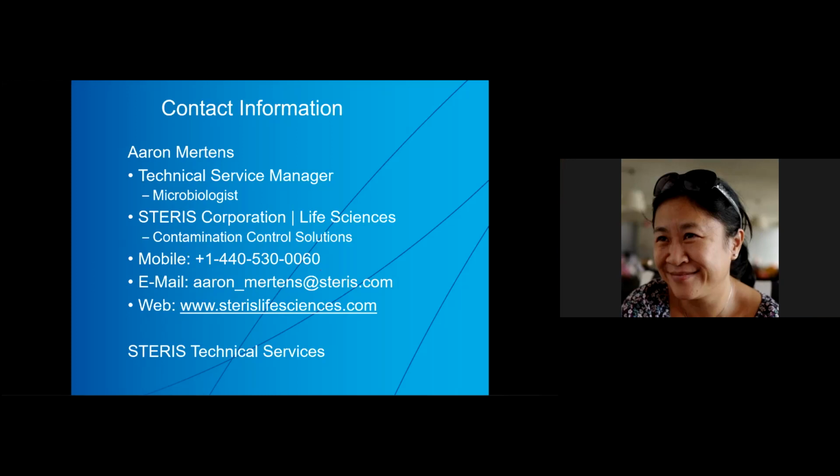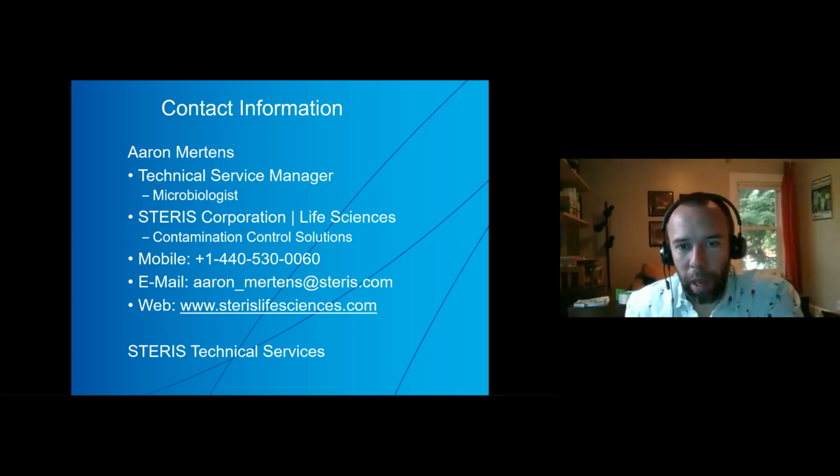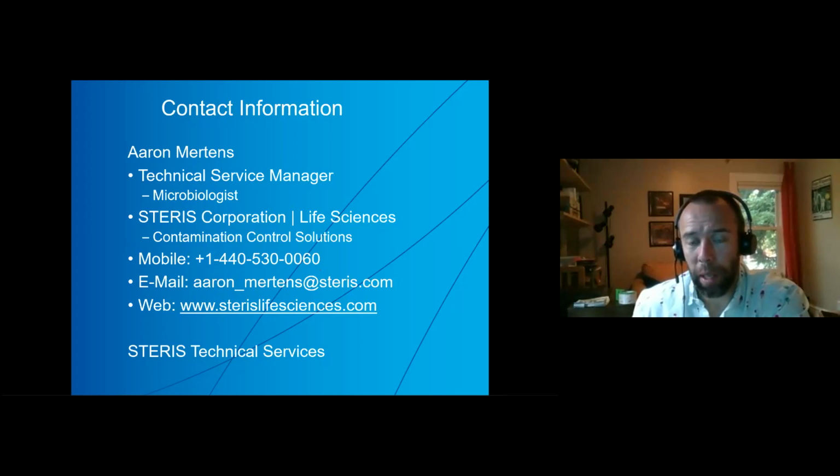Hoi Uyen asks, how many probes are required at minimum for sterilization validation? Again, I would say minimum of 12. During the cycle development, you're finding the worst case locations. So a lot of the work happens prior to the validation, where you might use during the cycle development many more than 12, but you're assessing that data and selecting the coldest or hardest to sterilize locations. But I would say minimum of 12. In a large autoclave, probably more like 20.